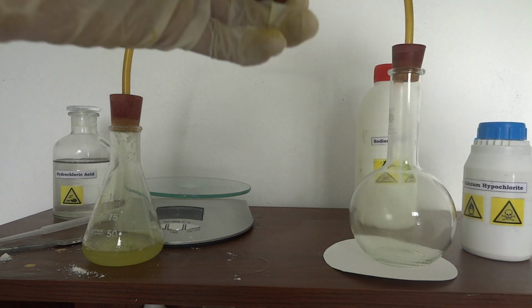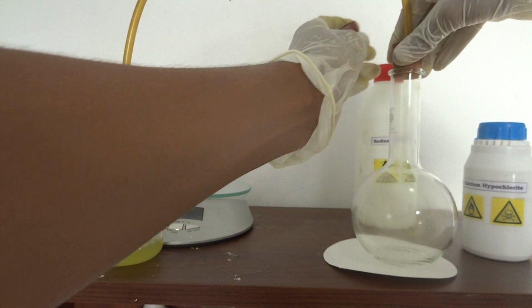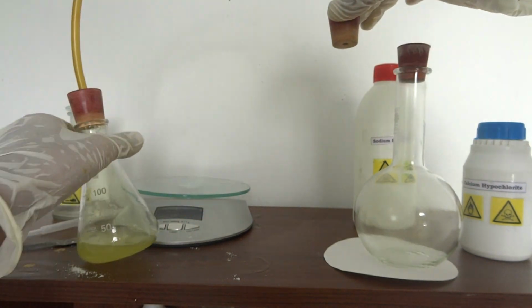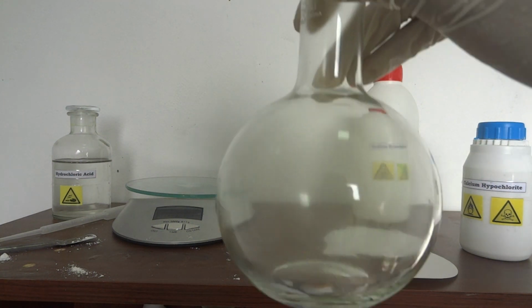Okay, so now I'm going to quickly stop this off. So this is the chlorine.